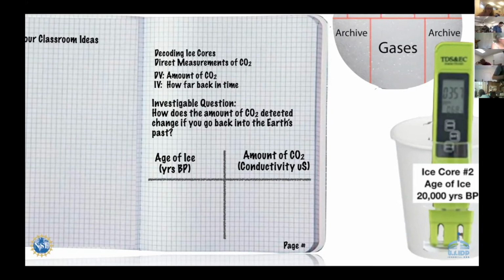Each one of those, you're going to do the same thing. Just put your conductivity meter underneath, read the number, rinse it off, and you're ready to go.